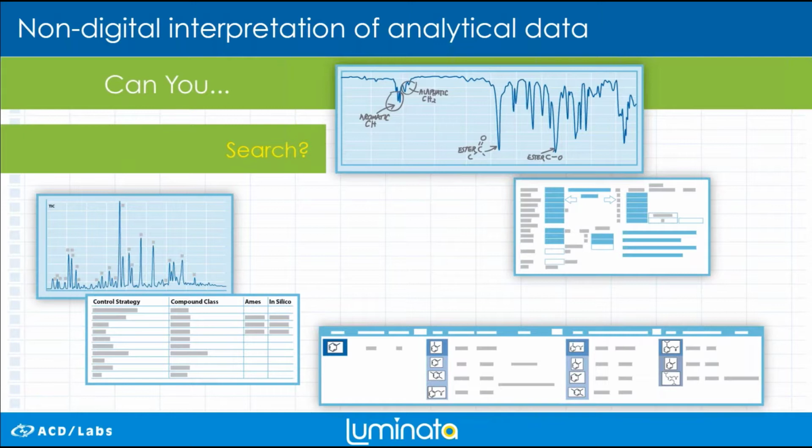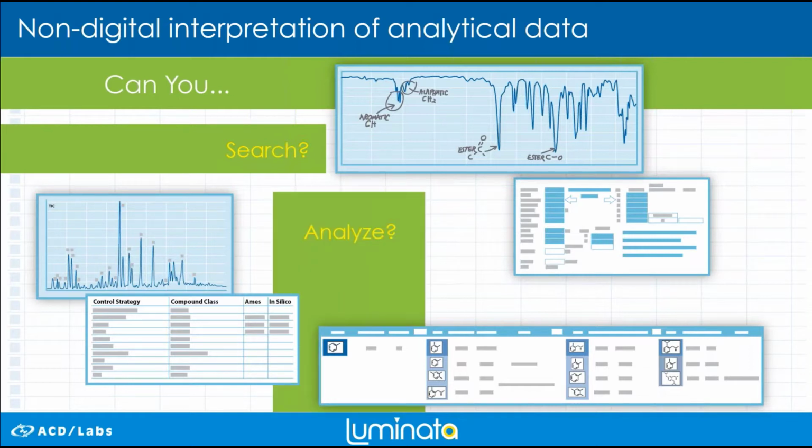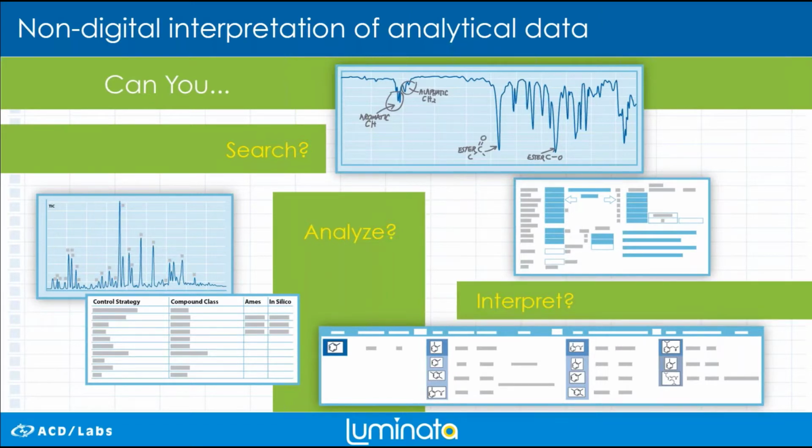If you're using Excel, do you have one Excel sheet? Is it 1A, 1B, 2D? Who analyzed this? Now, again, we're taking a simple case. You may have a spectra here, you have a chromatogram, but how is it done? Where is it being collected? Where are you storing this information? And an interpretation, again, are you using a CDS system for your chromatogram, or what are you using for your high-res data? Who's seeing this? Where is this being placed? And that became crucial questions on really building Luminata through ACD/Labs.